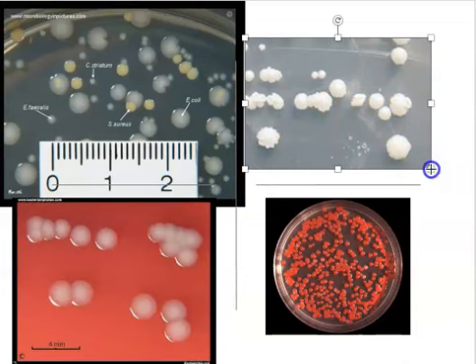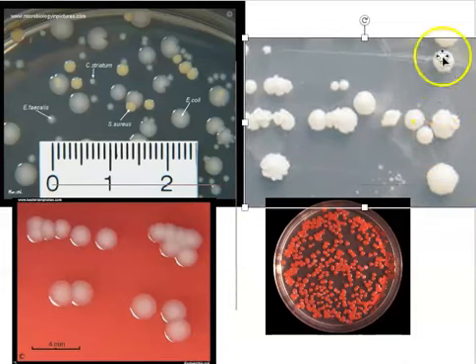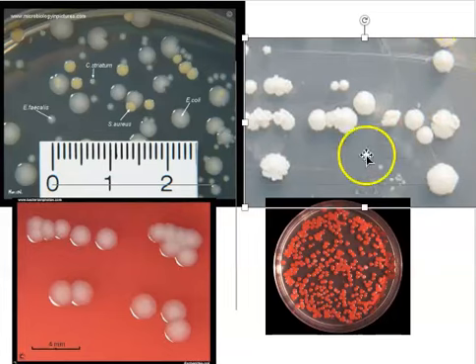If you look at this picture up here, again, you can see multiple colonies on this plate and multiple types of colonies. I've got these larger circular colonies growing that have a nice smooth margin. But down here I have a large colony type growing that has an undulate margin, or an uneven margin. See that? I've also got some kind of an organism growing that produces small colonies. I may even have another organism down here growing, producing even smaller colonies.